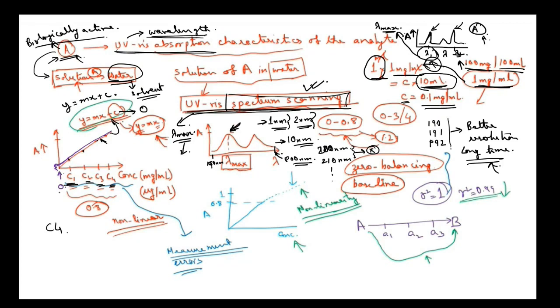So at concentration 0, if there is some absorption, that means that even at 0 concentration there is some analyte, and hence it is absorbing the radiations. So we do not want that condition to happen. So that's why we need to see that the c is always 0. Okay, and we need to put a constraint while we are doing the modeling.